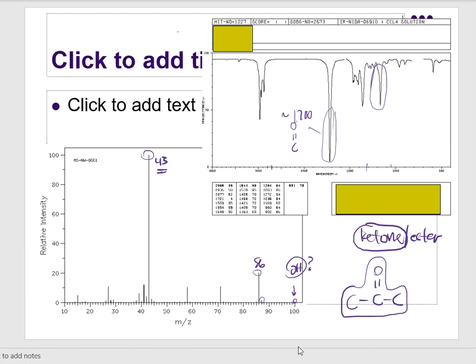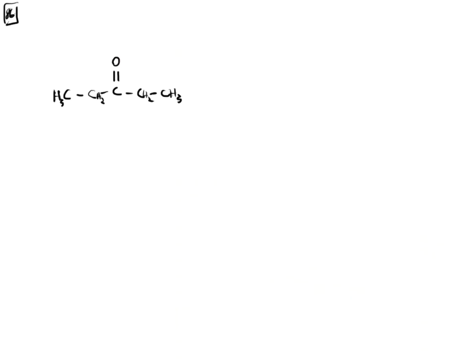All of the other M peaks are pretty dominant, meaning that you'll be able to see them if they're present. Just like the 86 that's here, this thing is fairly large, right? Your eyes go to it, you know that it's an important peak, and we've labeled it. The only one that you really have to question that way are the alcohol functional groups, because they can be super, super tiny, because most of the time the entire fragment does not go through. Just with the missing electron. The OH is going to pop off of there when it can.